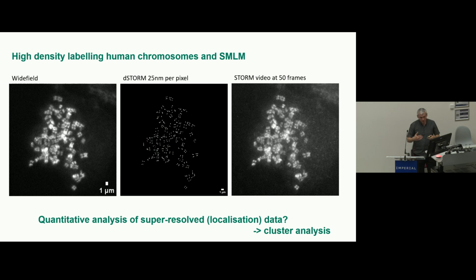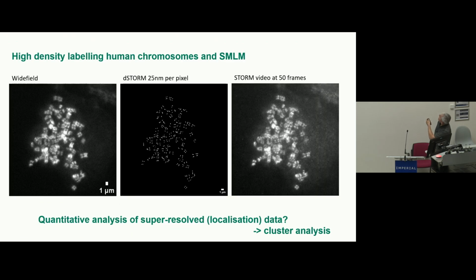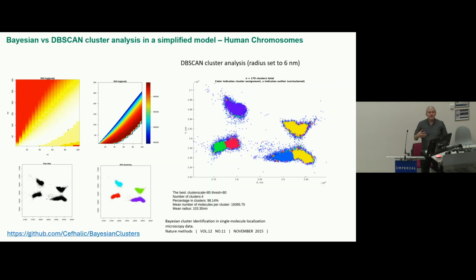Since then we have been moving on. You can image anything that you can label with fluorescence, so you can go into this application of super resolution imaging. Here is a preparation of chromosomes. For the dye, we can make a synthetic nucleotide that is fluorescent. And here is the video where, under this illumination, you get this blinking. This is the 100x imaging, and when you do super resolution, you see a much crisper rendering of these structures.